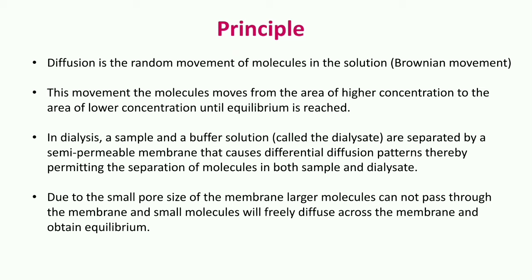Owing to the small pore size of the membrane and the larger molecules which are present inside the dialysis bag, the larger molecules cannot pass through the membrane and the small molecules freely diffuse across the membrane to obtain equilibrium, hence bringing about separation of solute.